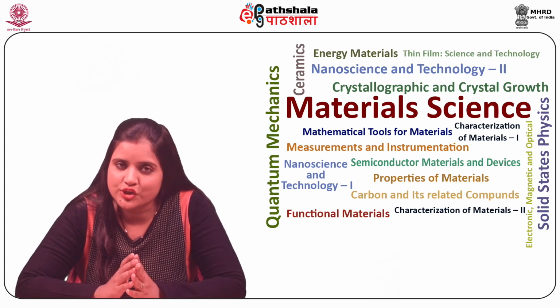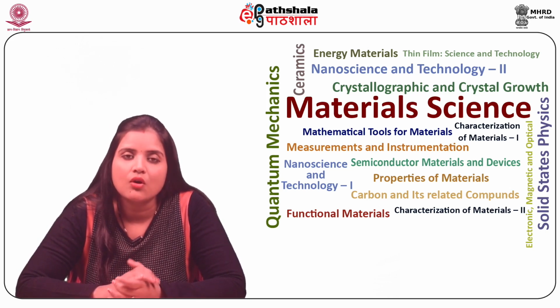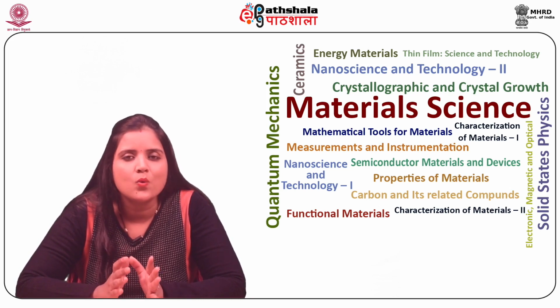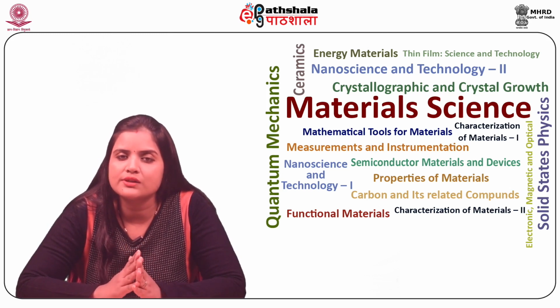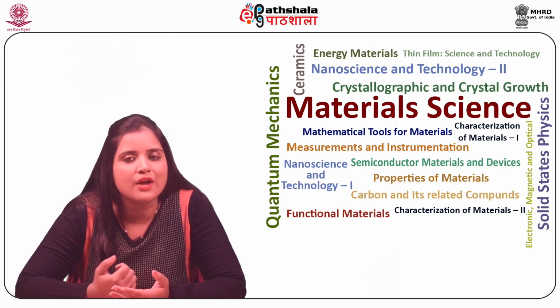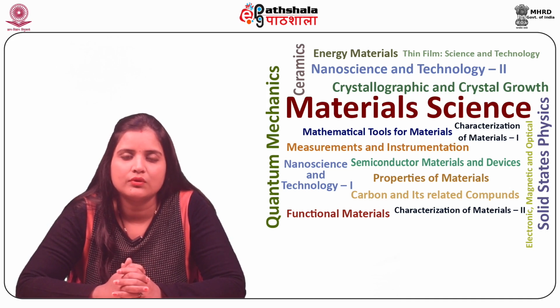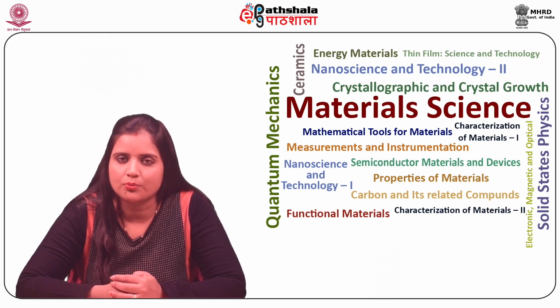Coming to the disadvantages, regular cleaning is required for appropriate functioning. Also, the chances of contamination by dust or other outside particles are high when the cements or adhesives employed for containing the oil under the slide are not properly placed. Then the cement may dry on the microscope, leading to degradation of the lens or other parts of the microscope. We will now discuss the applications of oil immersion microscopy.